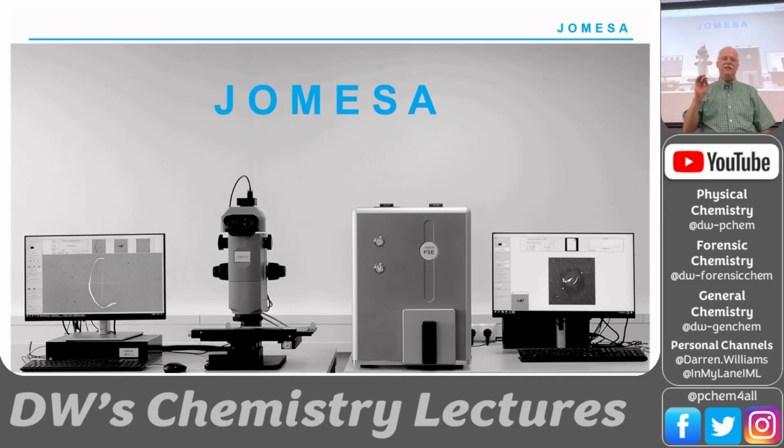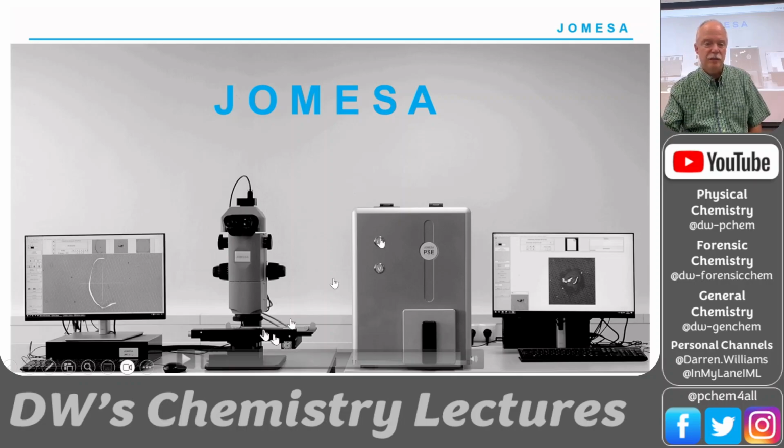So doing it by hand is incredibly tedious. So now they make systems that will do this for you. I talked about the cascade of particles flowing in front of a camera. Here, this analyzes filter disks. So if you can get the particles dispersed on your filtration disk, you just put it in this microscope and it'll do the counting for you. So let me show you this system.